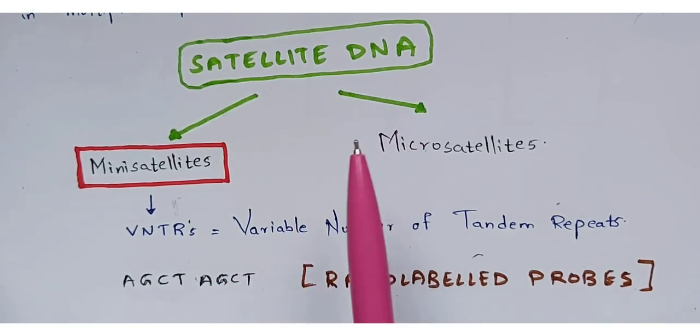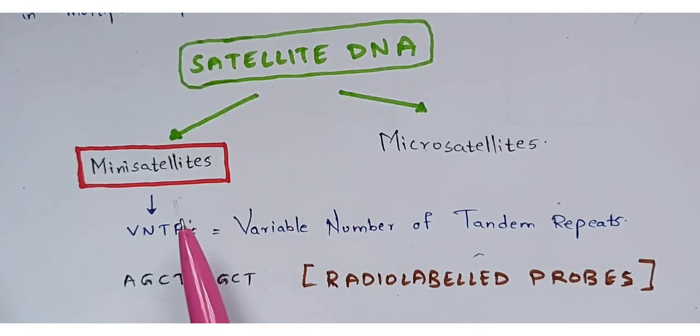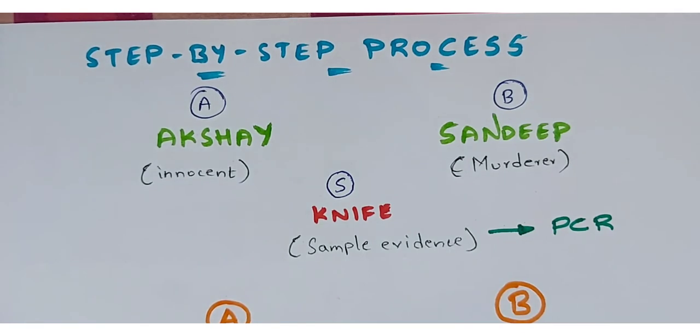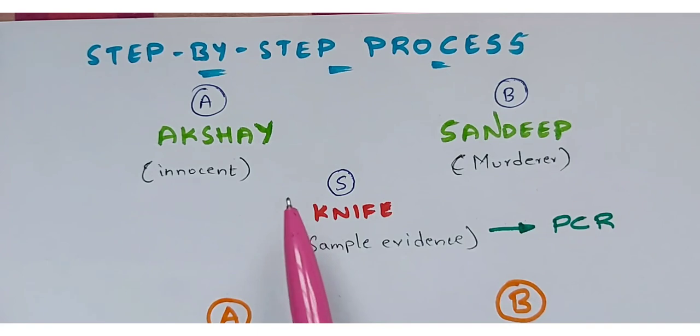So till now, I hope you people understood, and now let us discuss the protocol, I mean the procedure which is involved in this DNA fingerprinting technology. So now let us look at the step by step process of this DNA fingerprinting technology. Before this, I am going to take an example so that you people can easily understand.